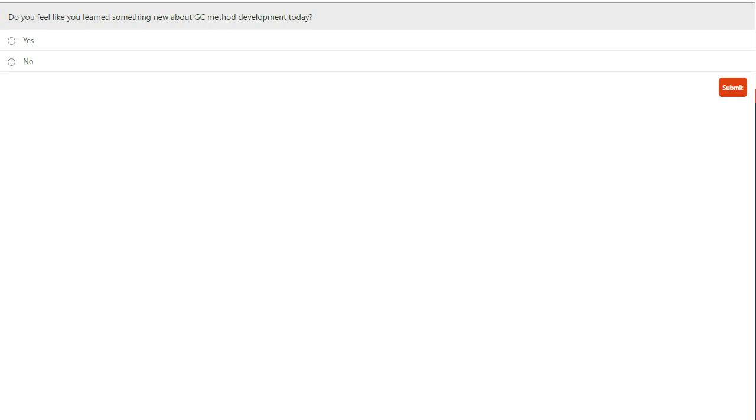Thank you. Okay, next up: it may sound irrelevant, but what kind of column do you recommend for propane and methane analysis, and what criteria do we need to pay attention to?